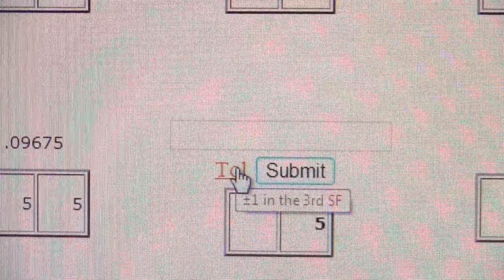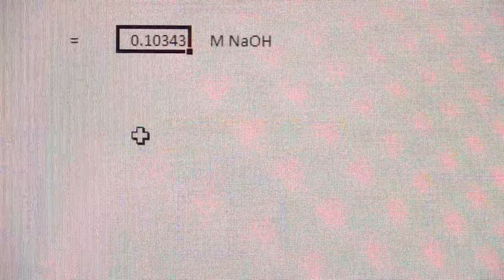And it automatically tells me my new molarity there, point one zero three four. I only want four significant figures. Actually this is telling me if I look at the tolerance, that's what this TOL is, says plus or minus one in the third significant figure. So you'll notice though it took the four significant figures. So I'm going to go ahead and put it in as a 0.1, what was it, zero three four.